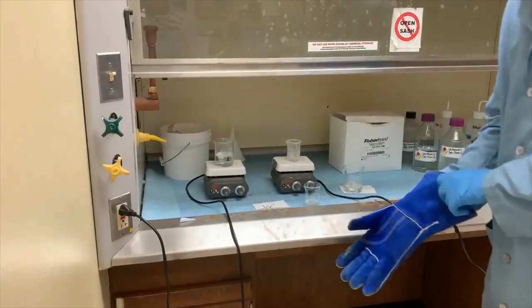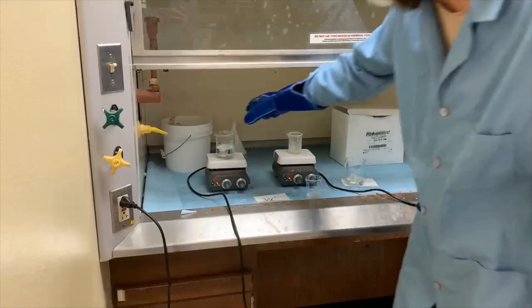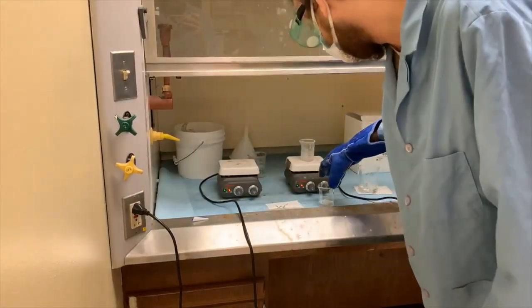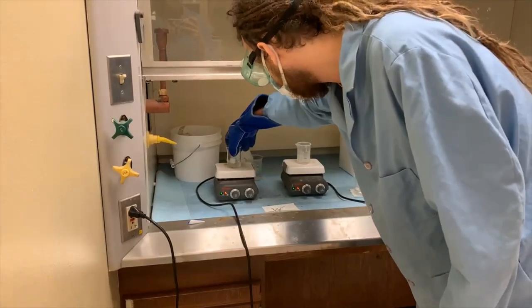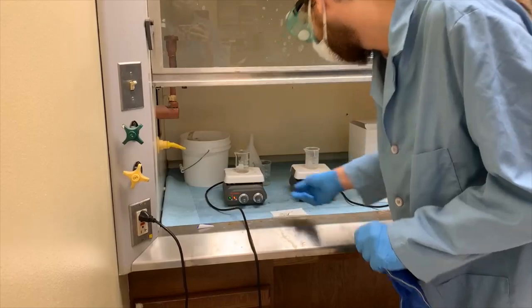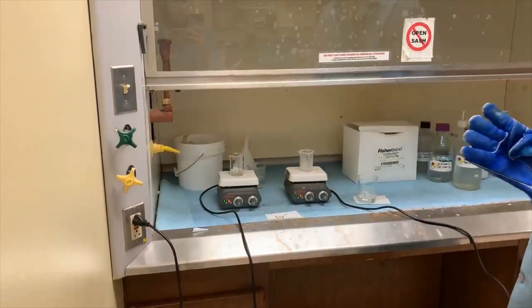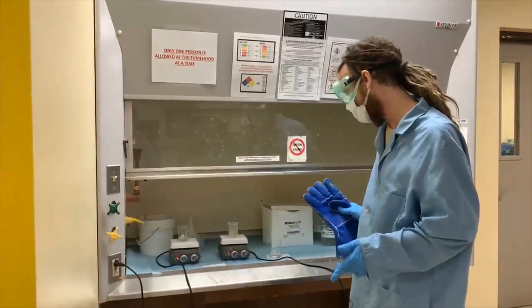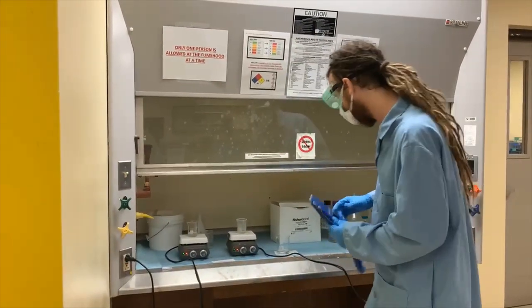Evaporate the water in a way so that all that's left is the salt. So we'll set this here. We'll turn the heat up. And I'll check back in with you guys once all this is done and ready.